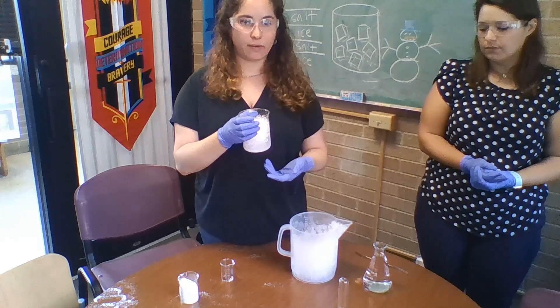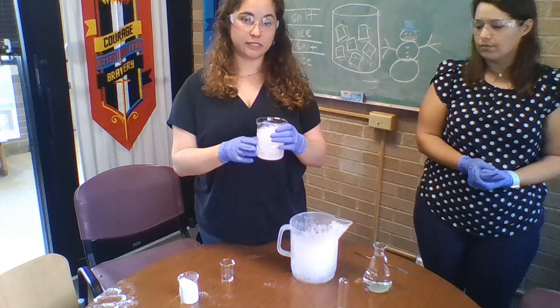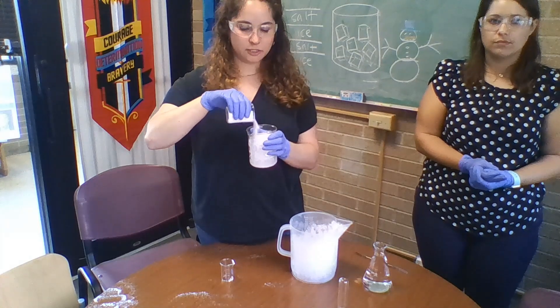The more salt you add, the colder it's going to be. So if you're having a hard time getting good freezing data of your solution, I would add more salt — do not be stingy.